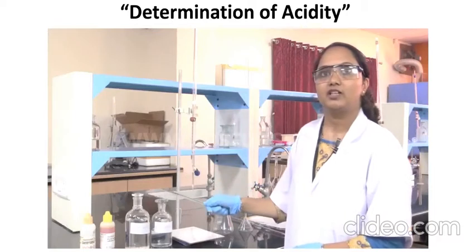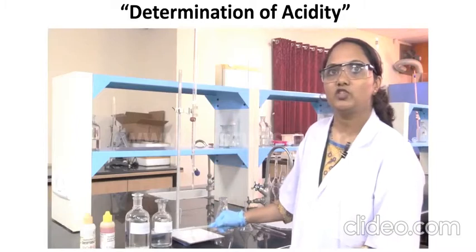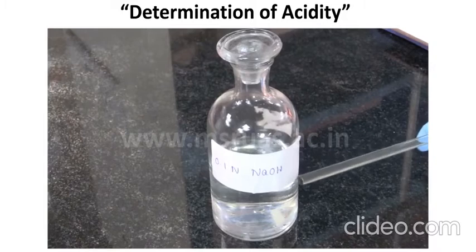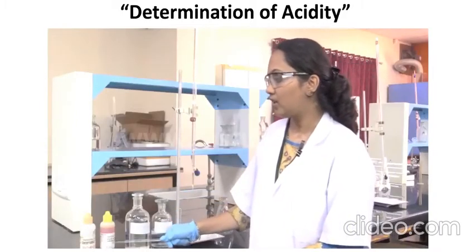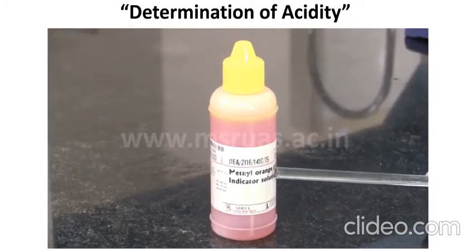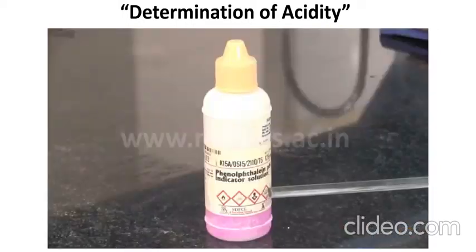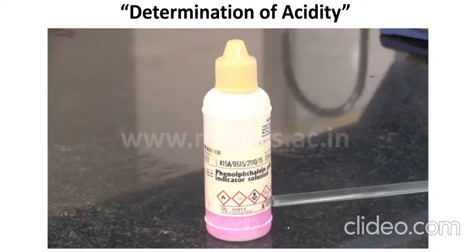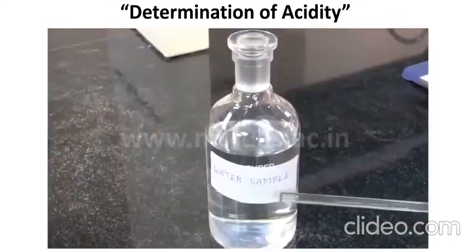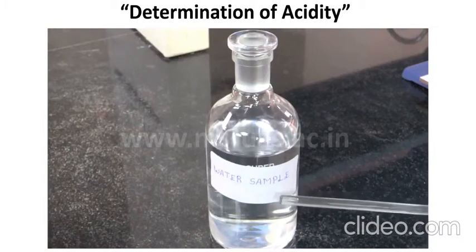The reagents required for the experiment are 0.1 normal NaOH, that is sodium hydroxide, that is to be taken in the buret for the acidity test. We require methyl orange indicator. When we add this to the sample, the color changes to orange. We require phenolphthalein indicator. And then the water sample. This is the water sample that is to be taken in the conical flask for the acidity test.